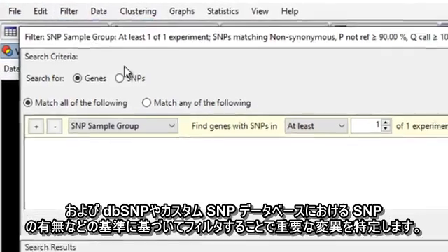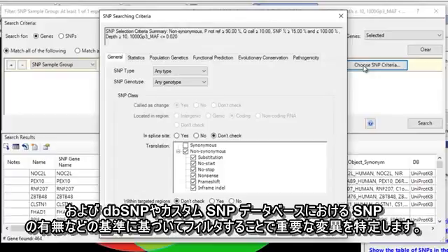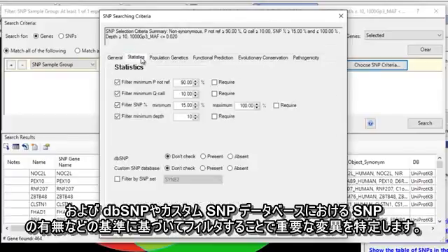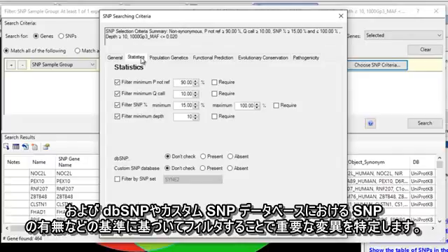Filtering on criteria such as SNP type, significance, assembly depth, and whether a SNP is present or absent in DB SNP or a custom SNP database.